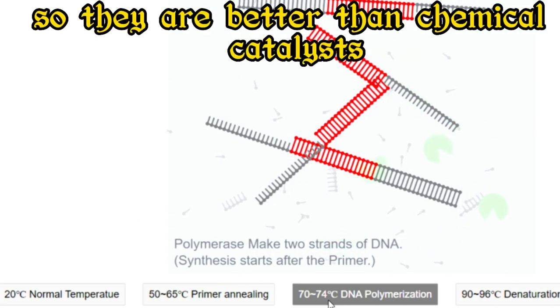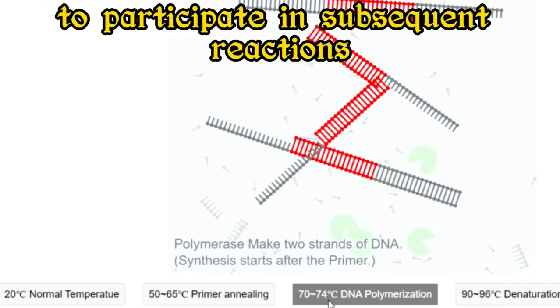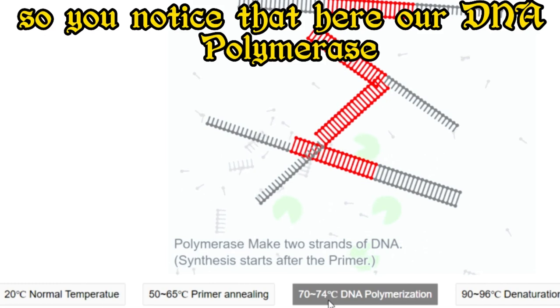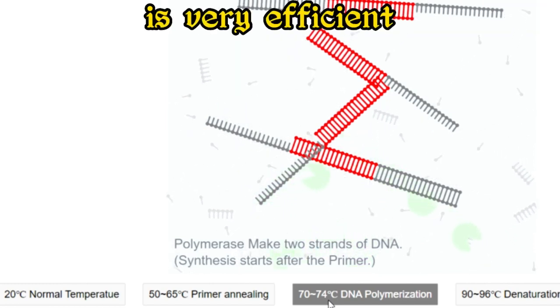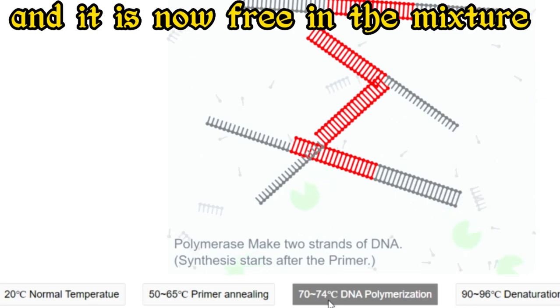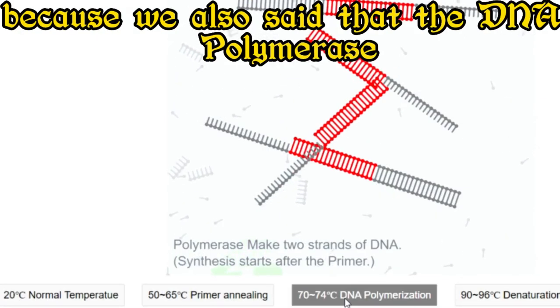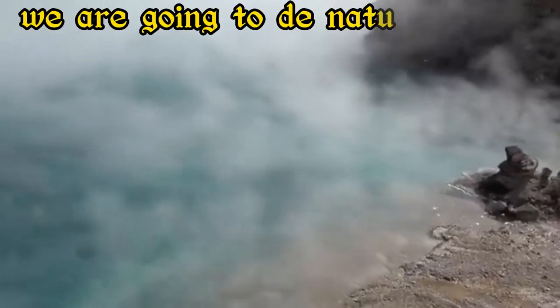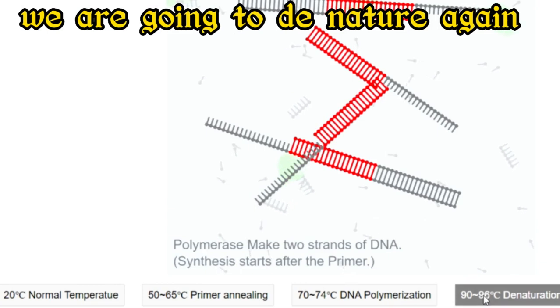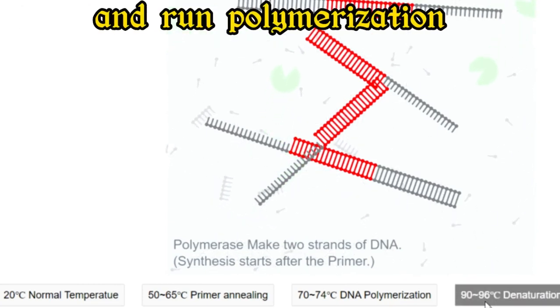So they are better than chemical catalysts because they're going to be available to participate in subsequent reactions. So you notice that here, our DNA polymerase is very efficient and it is now free in the mixture, ready for another reaction. Because we also said that the DNA polymerase is tough, it's going to withstand these high temperatures. We are going to denature, again, attach some primers and run polymerization.